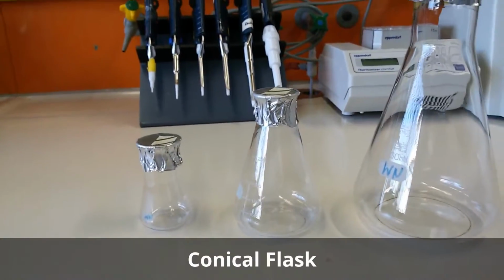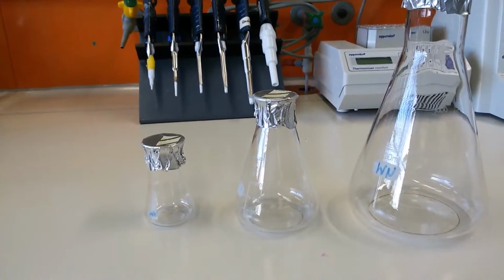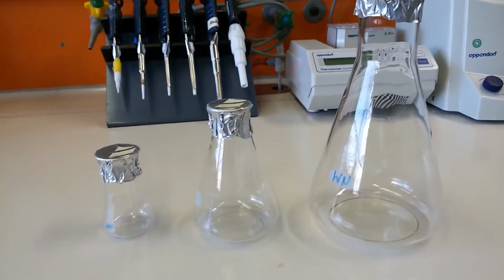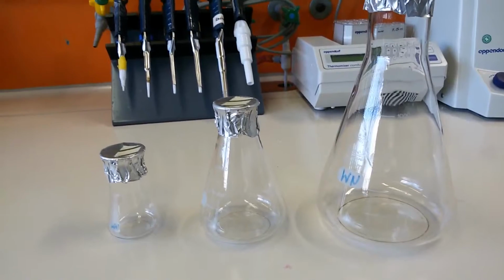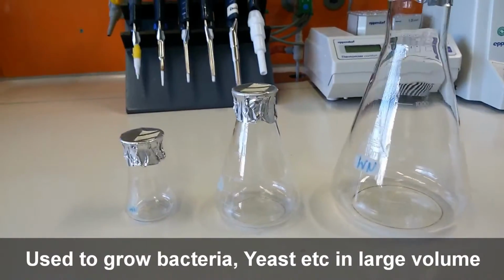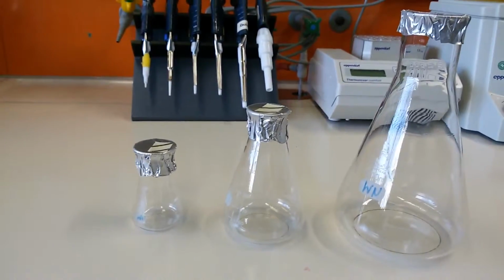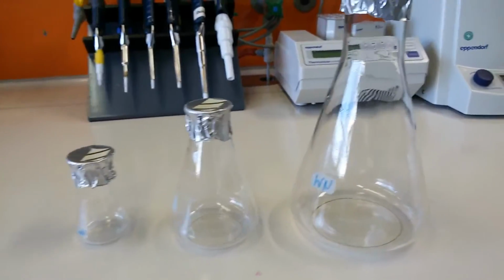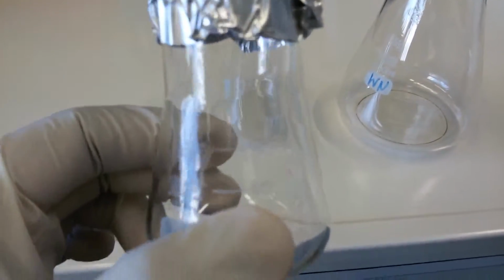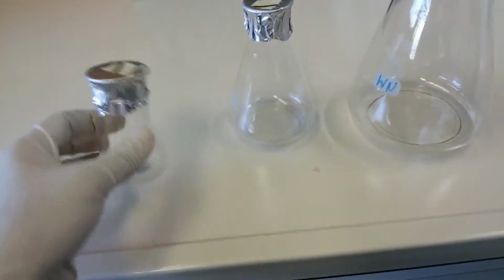Now you see in front of you conical flasks, and if you know them, that's great. If you don't know them, I will tell you. These are the conical flasks. They have a conical shape, and we use these conical flasks to grow cells, to do bacterial culture, yeast culture, sometimes animal cell culture, and sometimes tissue culture also. They're very important. They're also available in different volumes, and you can see it here. This one is 50 ml, and we will only use it to grow 10 ml of culture, not more than that.